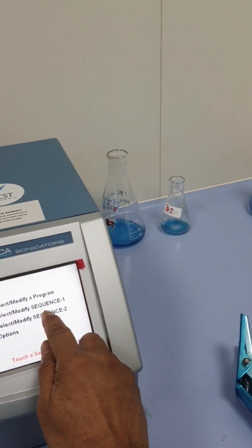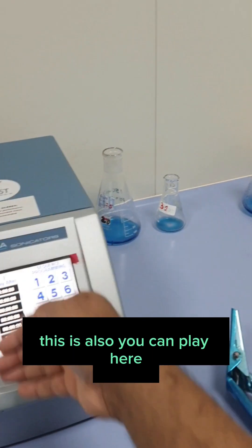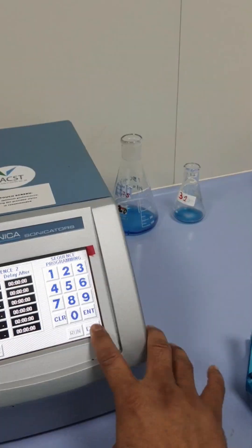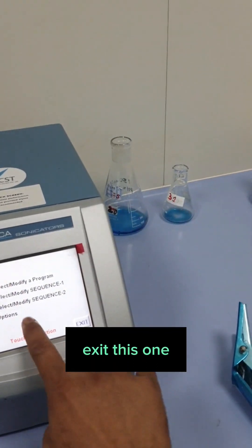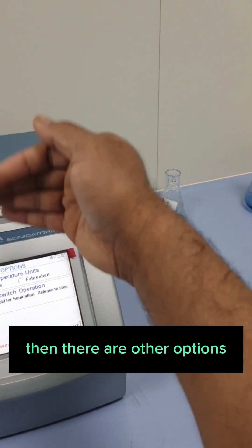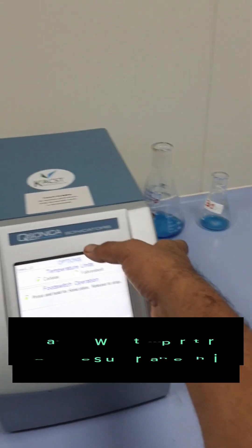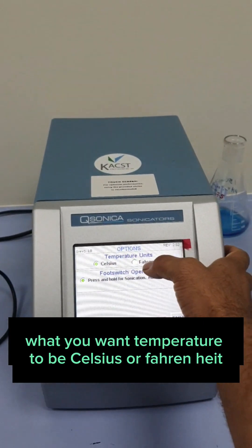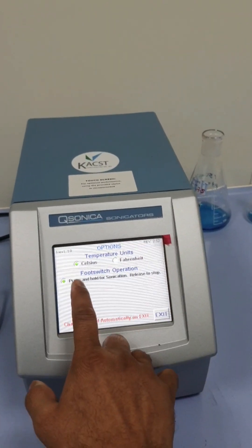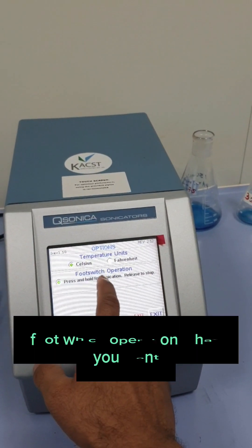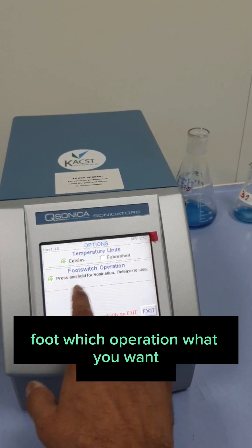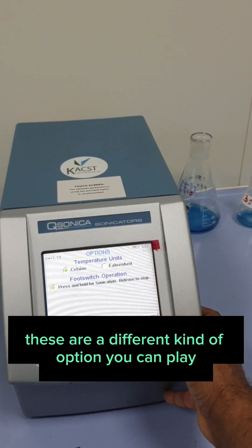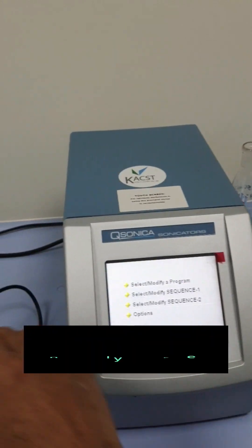This is also, you can play here. Exit this one. Then there are other options. What you want. Temperature to be Celsius or Fahrenheit. Foot switch operation. What you want. These are different kinds of options you can play with.